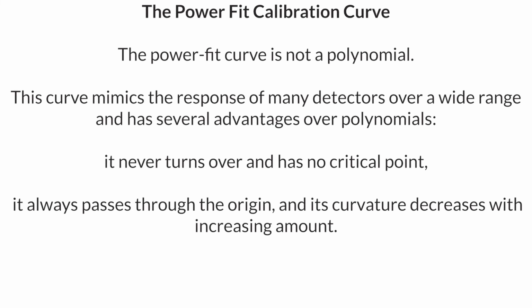The power fit calibration curve. The power fit curve is not a polynomial. This curve mimics the response of many detectors over a wide range and has several advantages over polynomials. It never turns over and has no critical point, it always passes through the origin, and its curvature decreases with increasing amount.